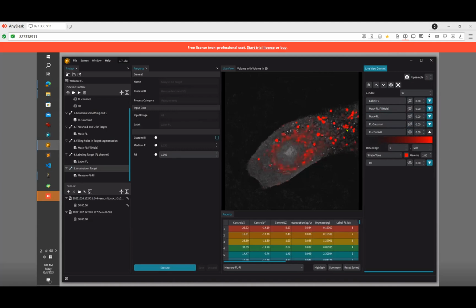If I explain the outputs here, for the fluorescence signal we apply the thresholding segmentation, and the result is like this. And we do some filtering here, but it did not change much because of the nature of the data, the sample. Based on this, we identify the objects to make it quantified, and the result is like this.